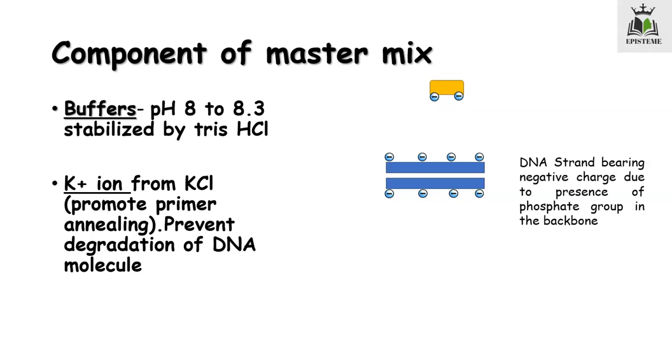To prevent this problem, we add these K+ ions in the backbone of our DNA molecule. Now see, these negative charges are masked and the primer can easily bind. The K+ ion also has a role in the prevention of degradation of our DNA molecule.